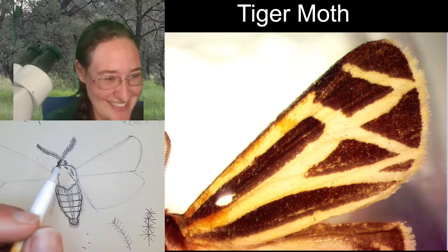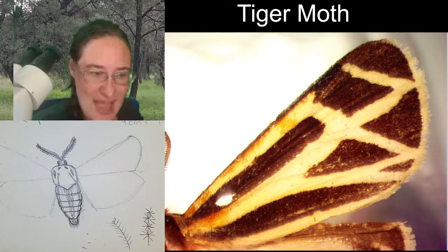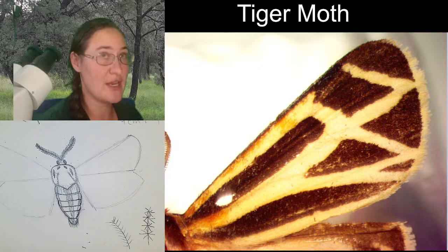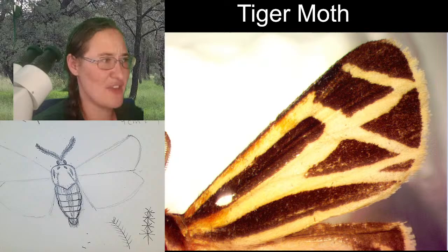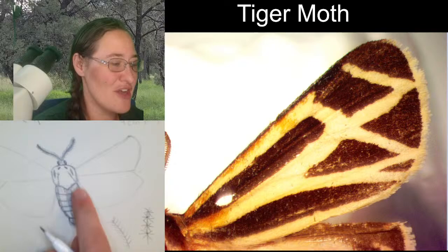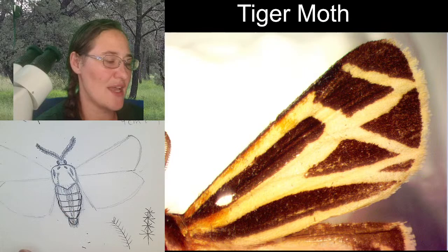Are there spiracles there on the sides? Caterpillars would have spiracles there, but I'm not sure how the adults breathe. Yes, they do have spiracles along the sides of the abdomen. But because of all the hair, I don't know if I've ever seen a butterfly or moth's spiracles. They do have them, and they are along the abdomen, not in the thorax or anywhere else, but I'm not exactly sure if I've ever seen them.